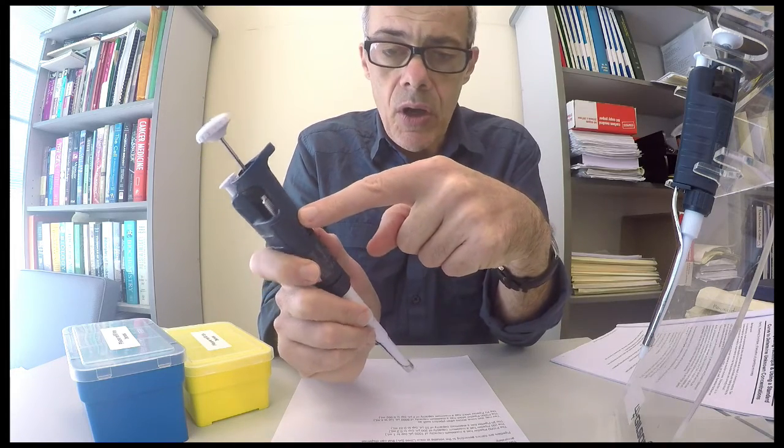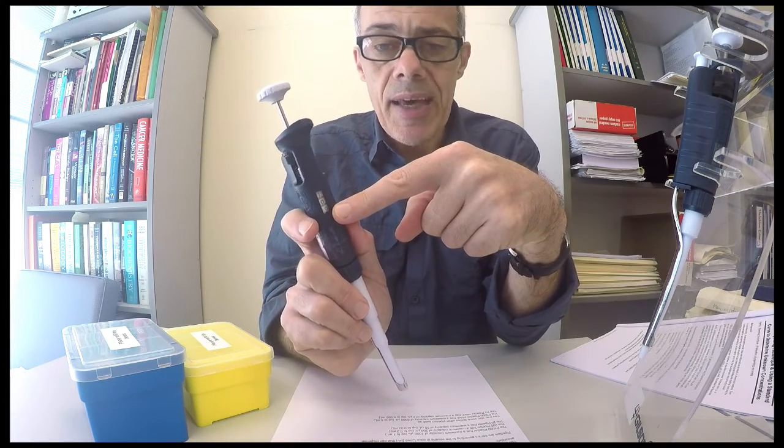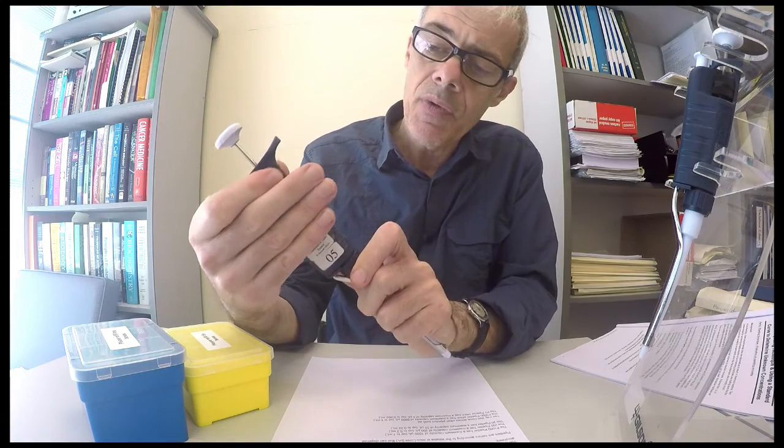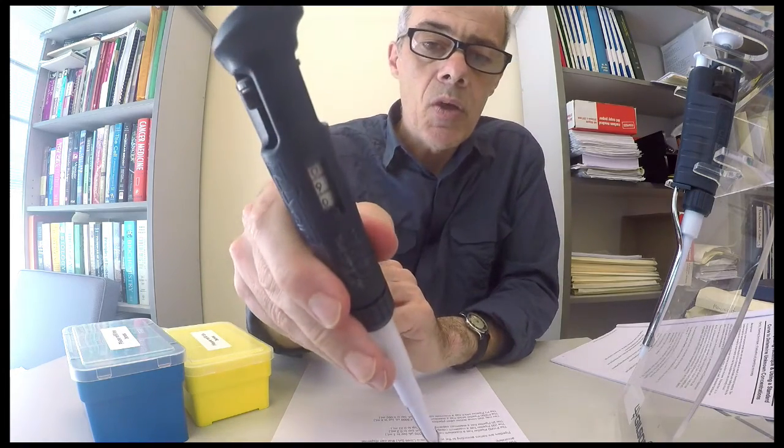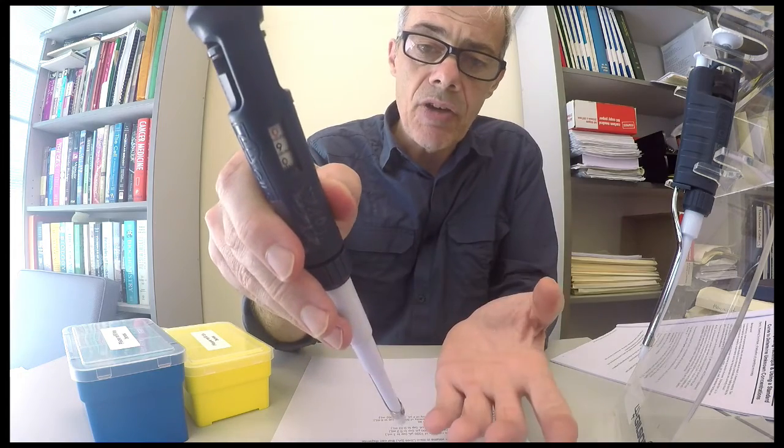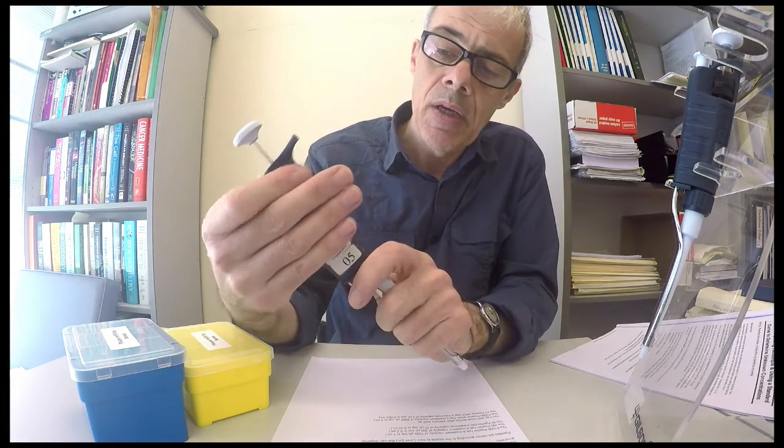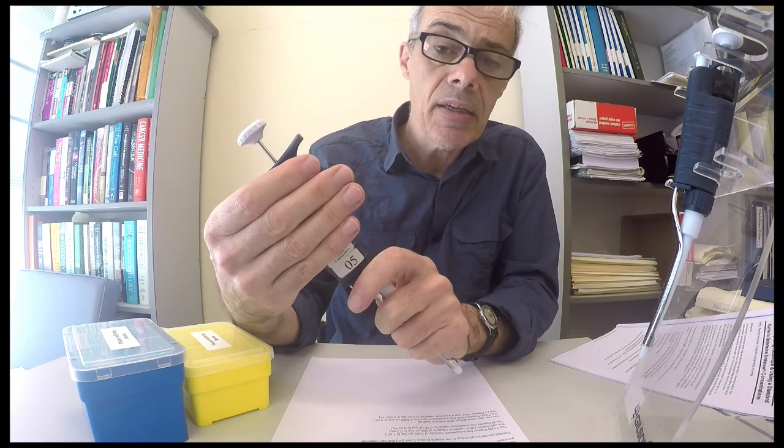So 100 on this scale refers to a thousand microlitres, and therefore 90 on this scale would refer to 900 microlitres. And we want to dispense 800 microlitres.